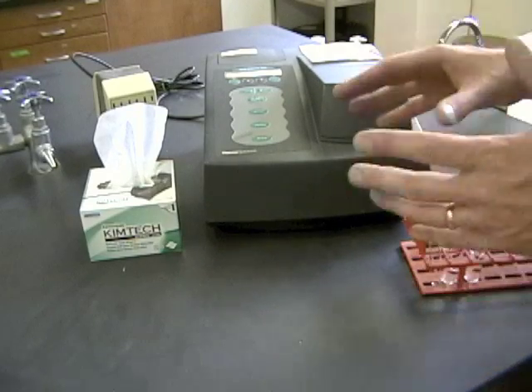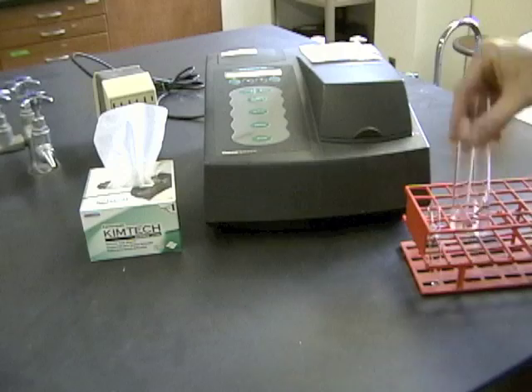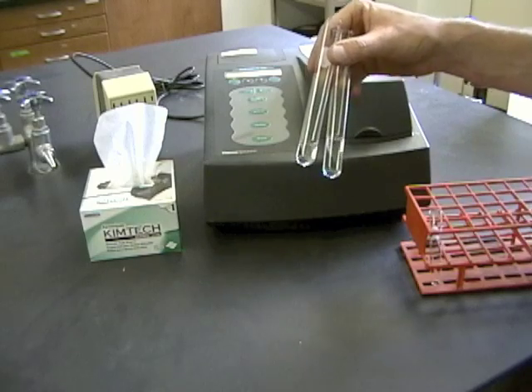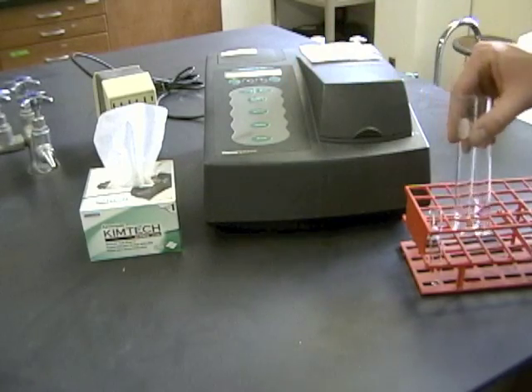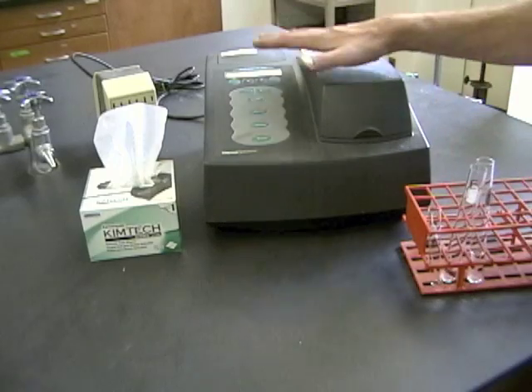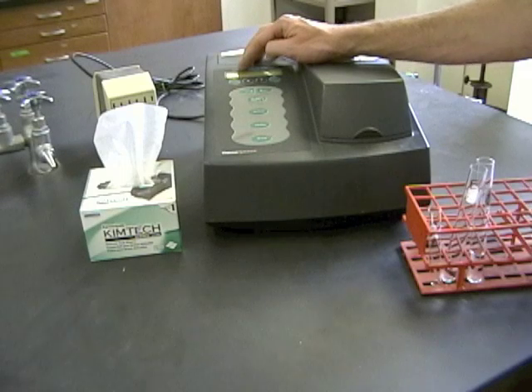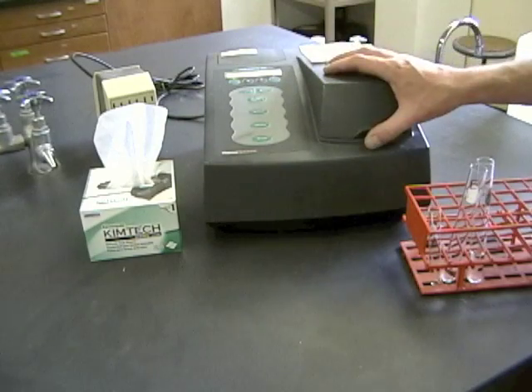We're finally ready to actually watch the reaction. It's important to remember that once the reactants and the enzyme get mixed together, that reaction is going to start right away. So you have to be all ready to go before you mix these. That means getting the spectrophotometer ready. Unlike in the last lab where you change the wavelength all the time, this time it's going to be left at 500 nanometers for the entire time.